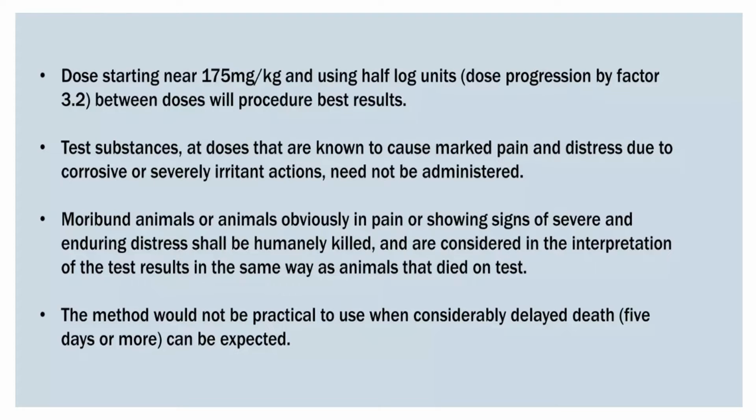Doses will procedure best result. So in OECD 425, 175 mg per kg is the starting dose we mainly select while conducting this study. They have decided the criteria that you have to choose 175 mg, and you have to give that dose to the animals.